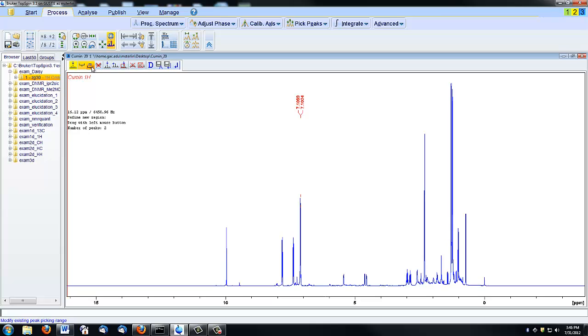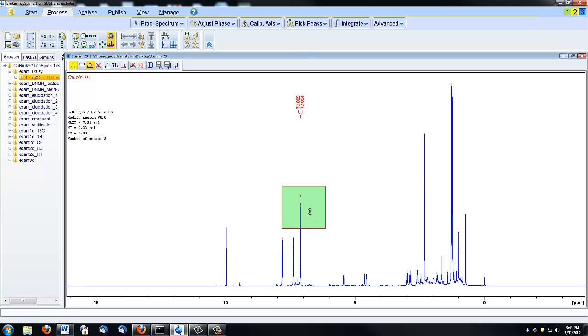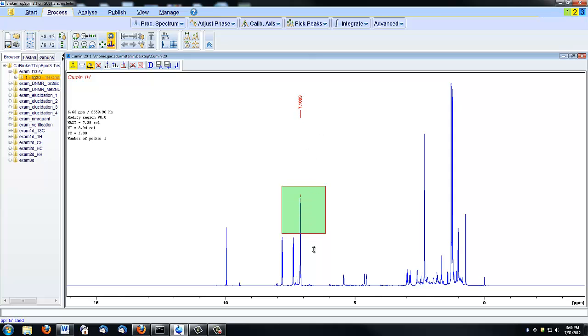If you wish to manipulate a region you've already selected, click this button, and you can either shrink, causing less peaks to be picked, or expand it to have more peaks being picked.